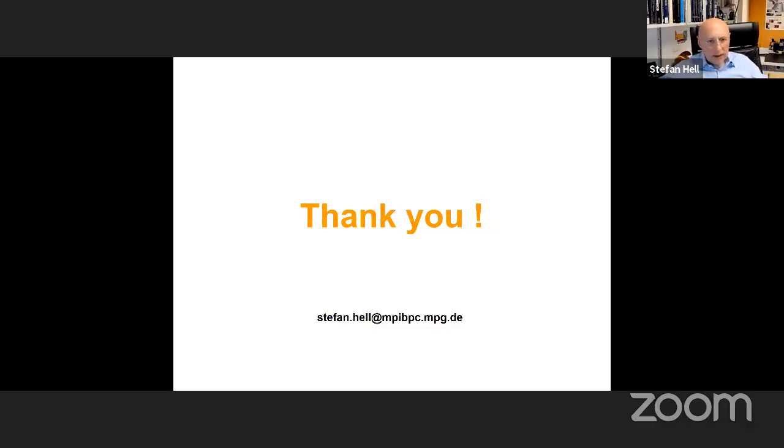if you suppress background, of course, then it's good. I talked about background a lot, but keep in mind, since it's a confocal system, the background still is very low. We have a big advantage of localizing with a strongly background-suppressing system, namely the confocal system. So I can imagine a big application field of MINFLUX, and of course also MINSTED, in areas where you have a lot of scattering, where PALM or STORM would never go because you don't have the means of suppressing background, say deeper into layers of cells or even tissue. I think there's a lot of potential for exploring that.